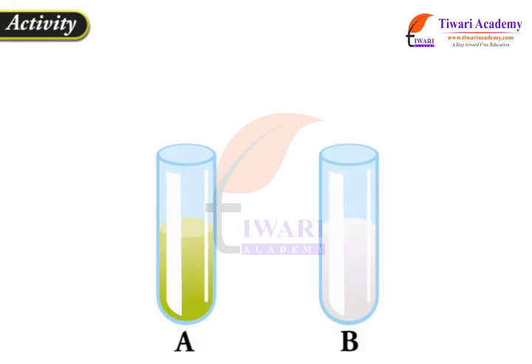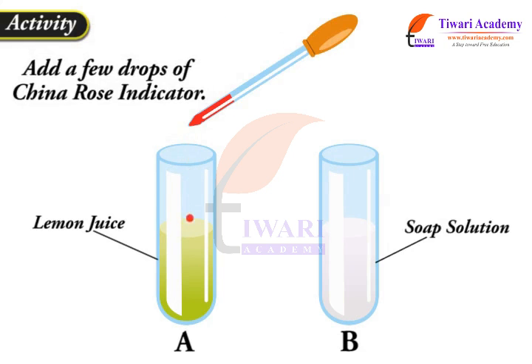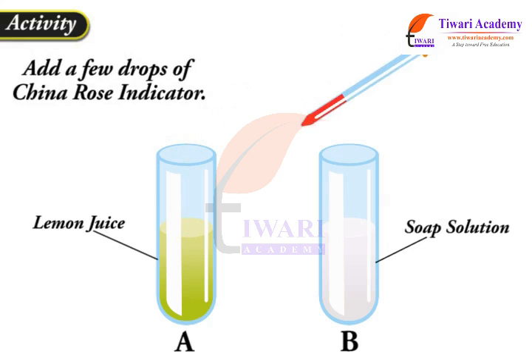Take two test tubes and mark them A and B. Add lemon juice in test tube A and soap solution in test tube B. Then add a few drops of China Rose indicator in both the test tubes.